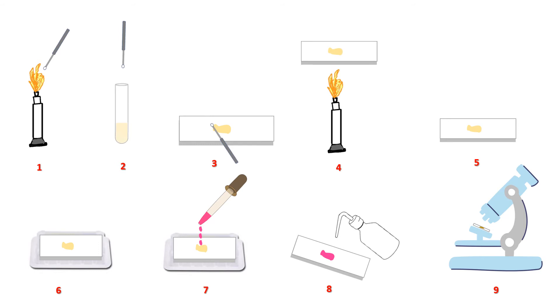Fifth step, let it cool down for a bit. Next step, place it over a staining tray. Next step, cover the entire thin film with the stain and wait for a minute. Next step, using a wash bottle, wash off the excess stain and gently dry it with blotting paper. Last step, with the help of immersion oil, observe this slide under a microscope.